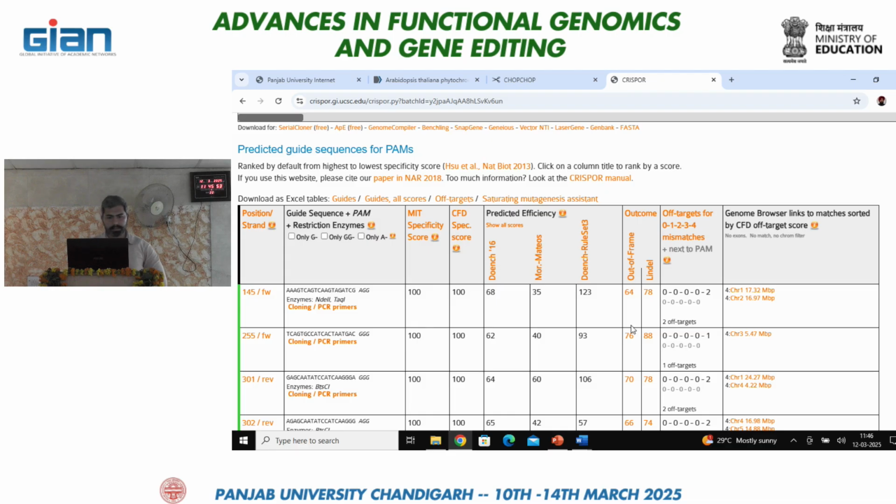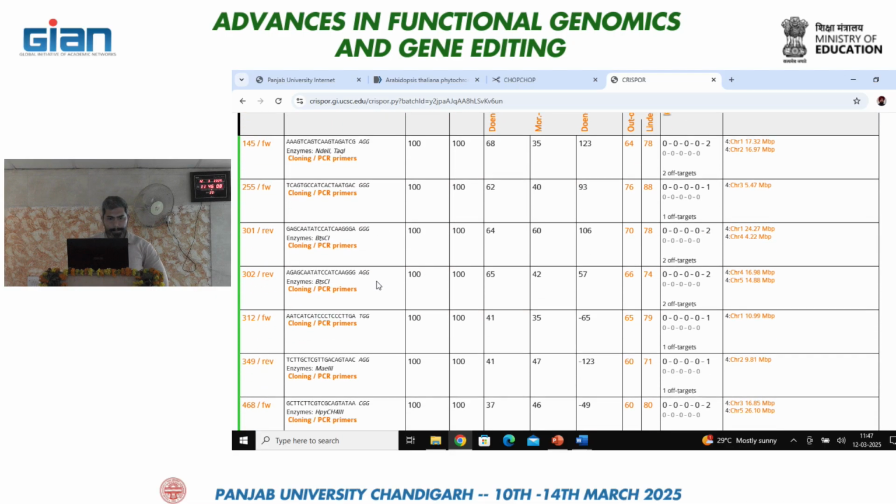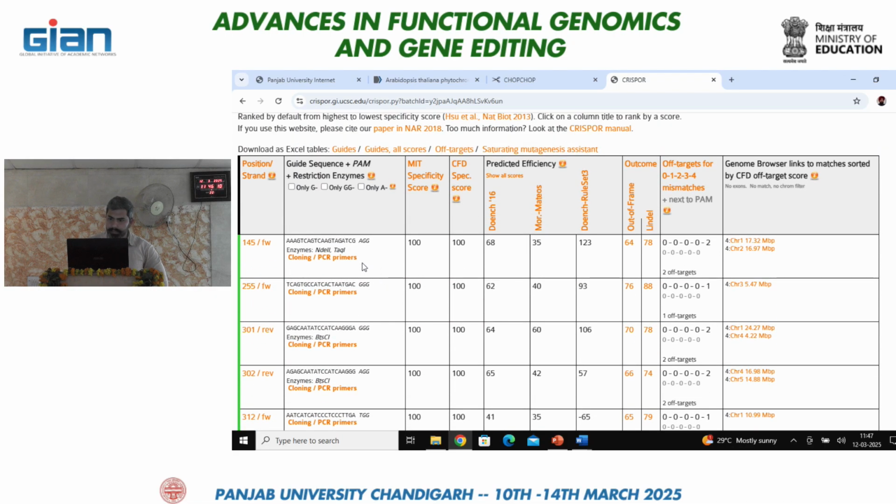As the genome assembly in this tool was old, I'm not sure that our result will align with the previous tool. Besides this, it has given some additional information as well, like the information of the 2 off target sites is written here, like it is in chromosome 1 and chromosome 2.